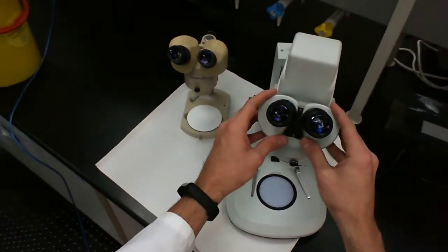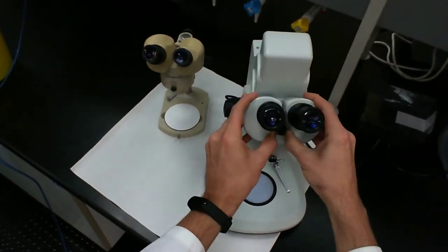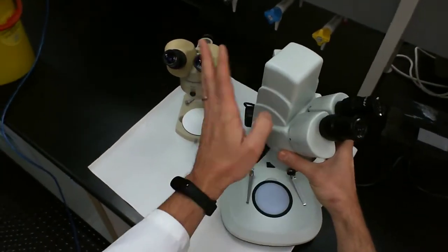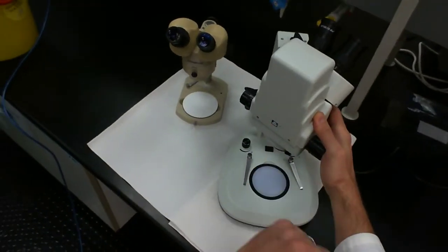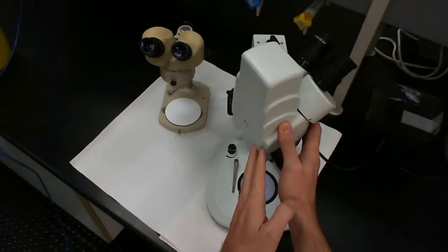There's a newer version. This one's fairly fancy and actually has a camera housing. There's a digital camera with a USB port built in. You can plug that into your computer and take pictures or video of what you're doing.